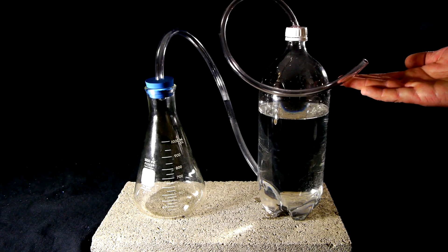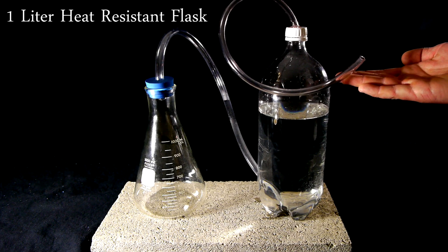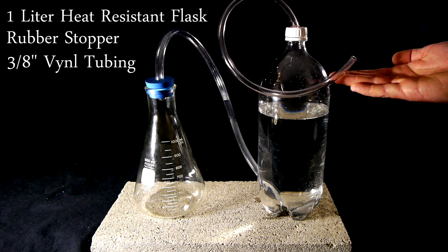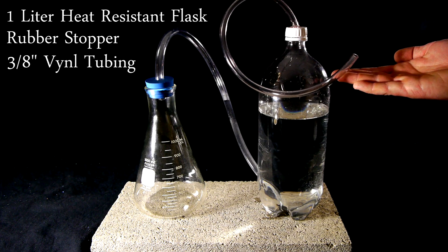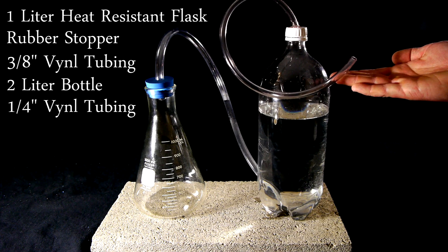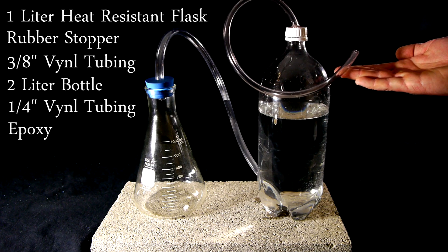In order to create the setup used in this video we will need a 1 liter heat resistant flask, a rubber stopper to fit that flask, 1½ feet of 3/8 inch vinyl tubing, a 2 liter bottle, 1 foot of ¼ inch vinyl tubing, and a strong epoxy. The flask and stopper may need to be ordered online but the rest of the parts can be easily picked up at any hardware store.